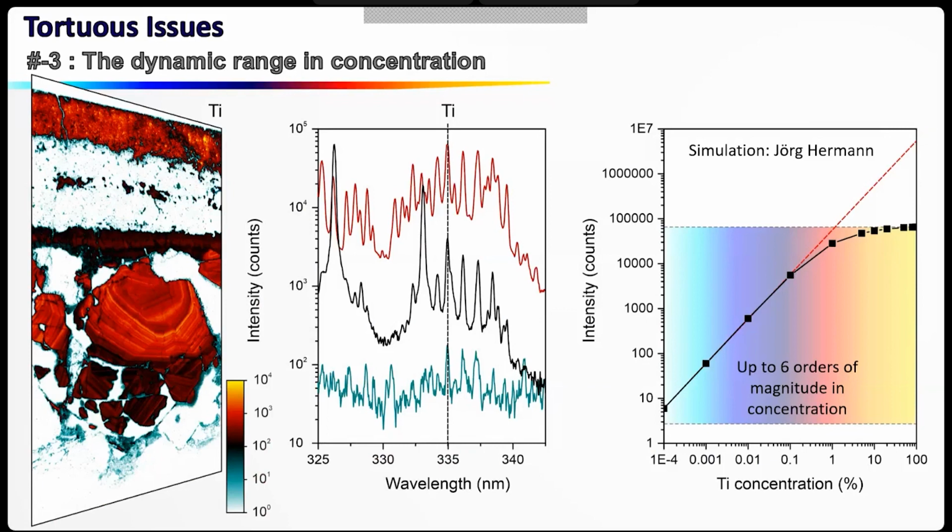But on the journey, this photon is absorbed by a surrounding atom, so this photon never reaches the detector. It means that the higher the concentration of the element of interest in your plasma, the higher the number of photons absorbed during the journey of the photon to the detector.